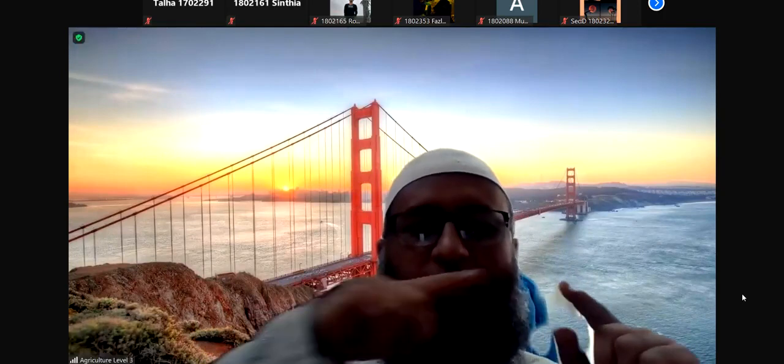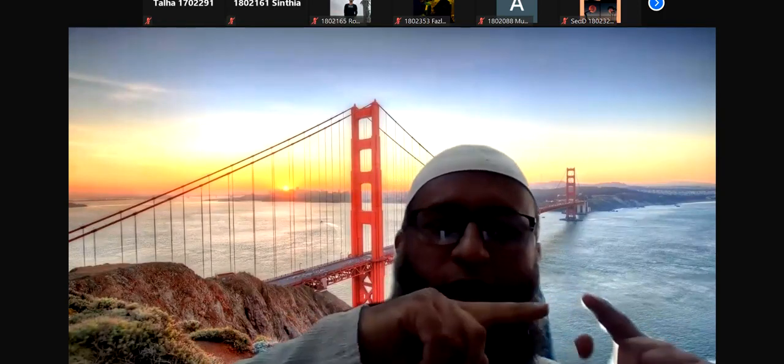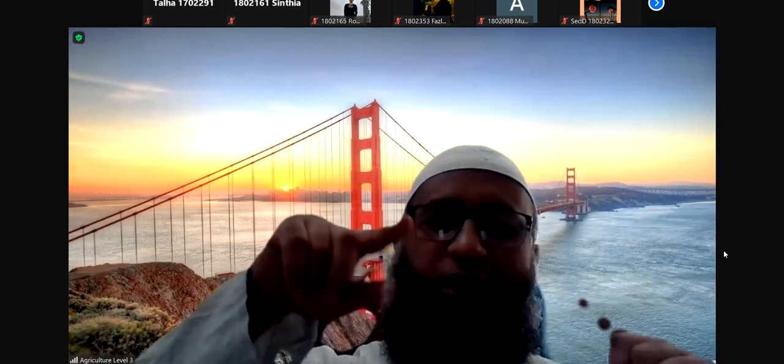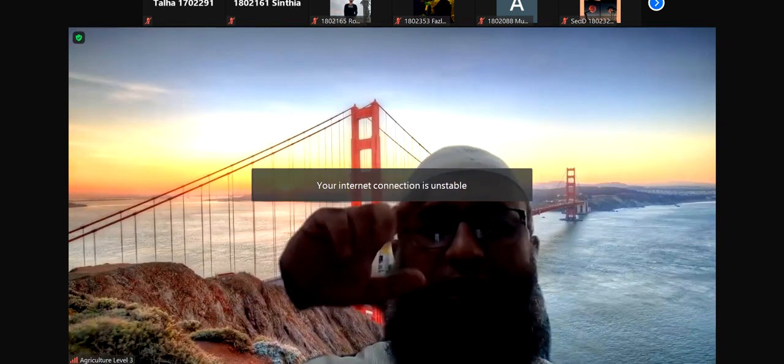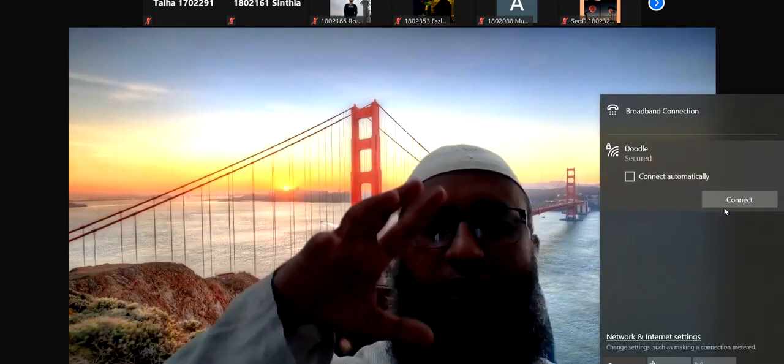So in this way, you can find the level of moisture in an area.